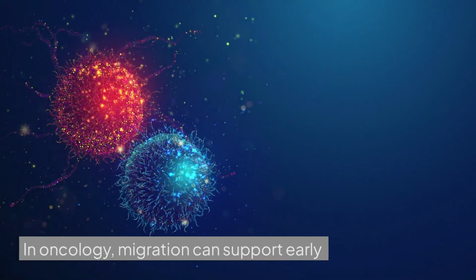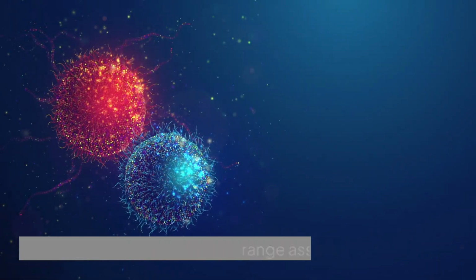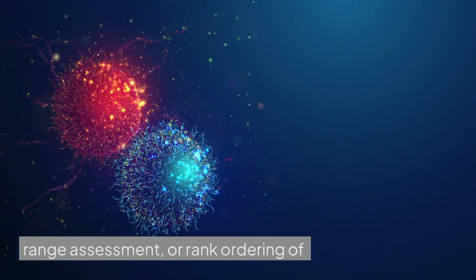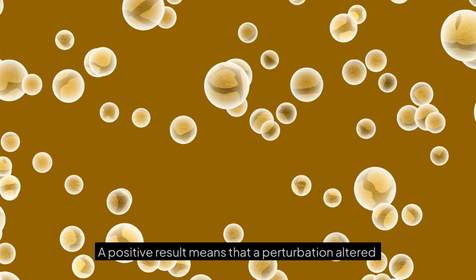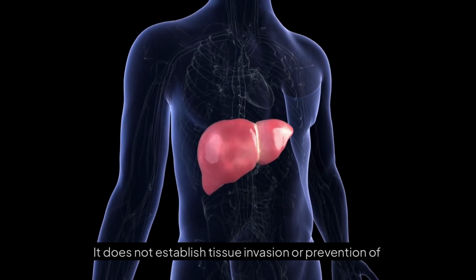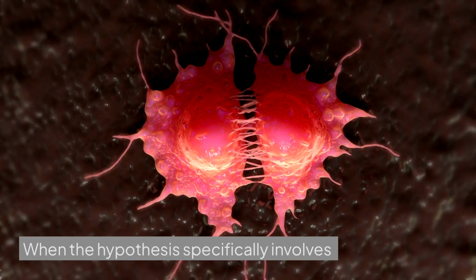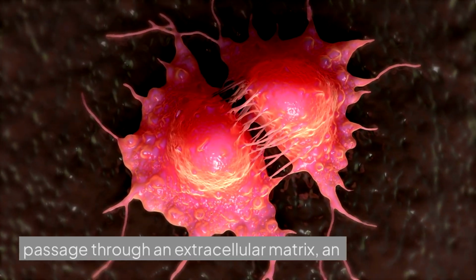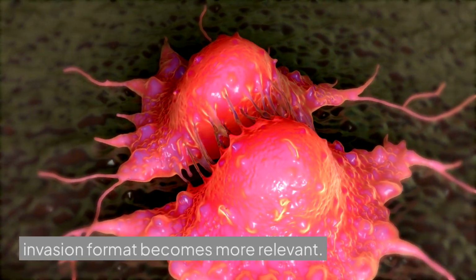In oncology, migration can support early phenotypic comparisons, concentration range assessment, or rank ordering of candidates. A positive result means that a perturbation altered movement under the stated conditions. It does not establish tissue invasion or prevention of metastasis. When the hypothesis specifically involves passage through an extracellular matrix, an invasion format becomes more relevant.